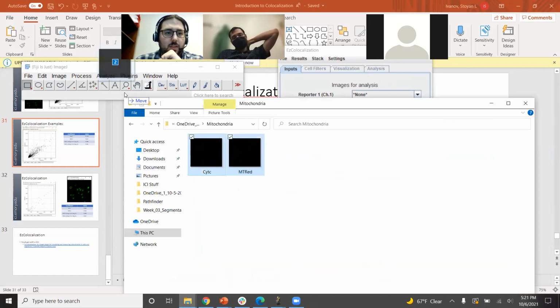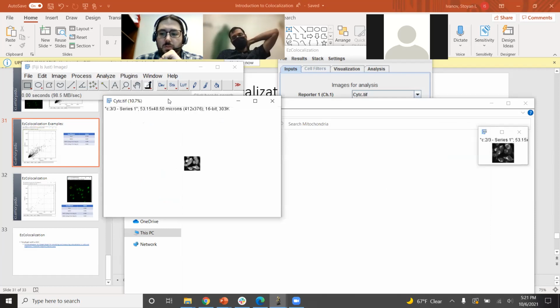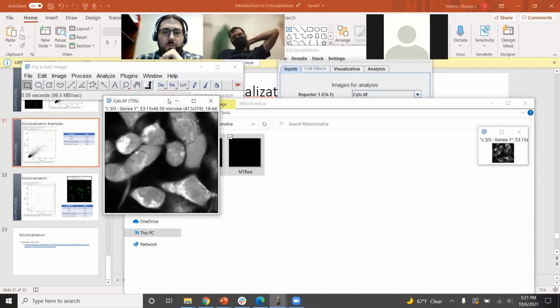Let's open 2 sets there. We'll go into what to consider for your regions of interest and why that could be important in terms of co-localization.